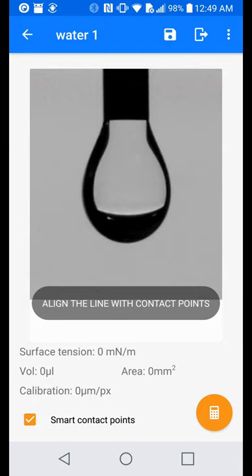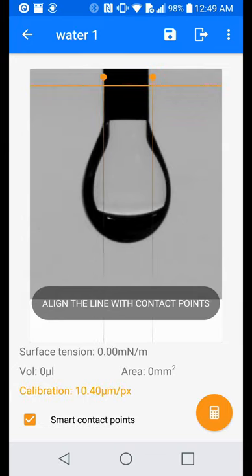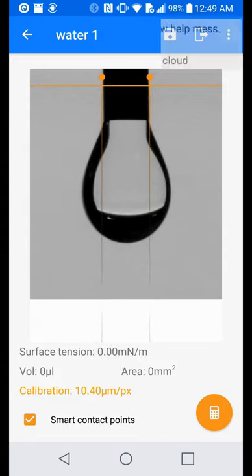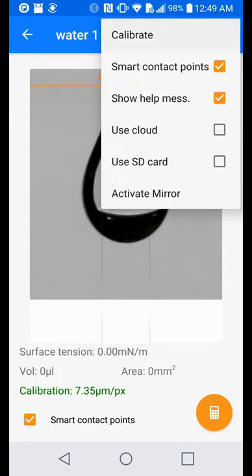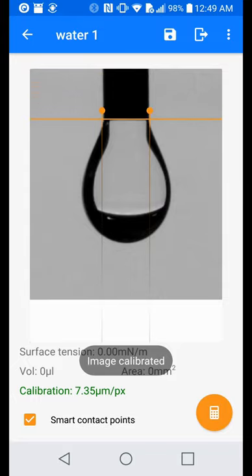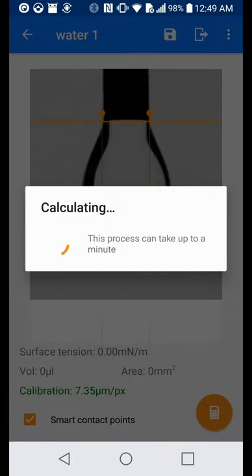Move the orange points to the left and right of the needle, and then hit calibrate. If the calibration number is green, then the number is correct. If it is red or yellow, then something went wrong. Generally, the lower the calibration number, the better.